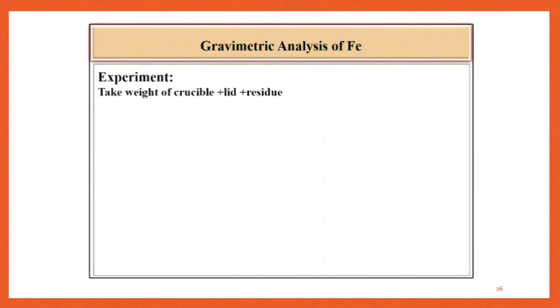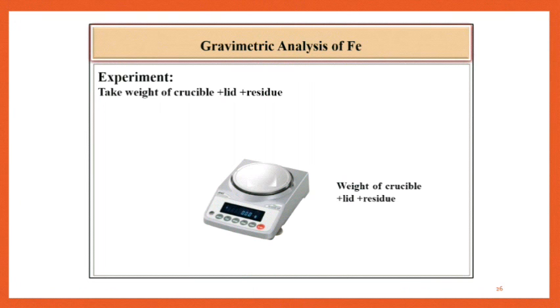Then cool this silica crucible well and weigh it again with the residue. This is the weight of crucible plus lid plus residue and record this reading as W2 gram.